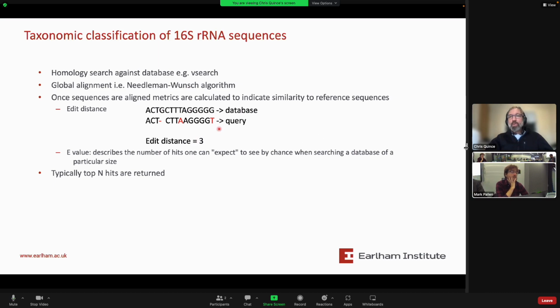Okay. Well, would you use a BLAST search for querying a 16S query against a reference database then? So that's a question for the audience. Would a BLAST be appropriate for that purpose, since they know all about it? Hands up if you think yes. Any hands up? Do we think no? Hands up no. There is 2, 3, 4. There's 5 people would say no. Everyone else is unsure. Chris? Okay. Well, I suppose in a way you're all right.